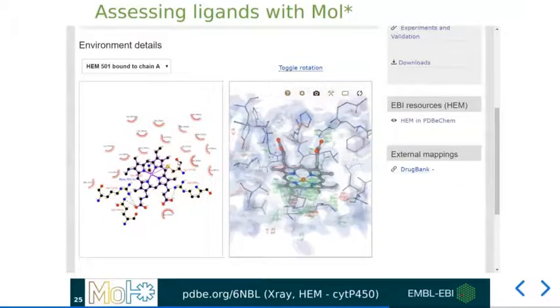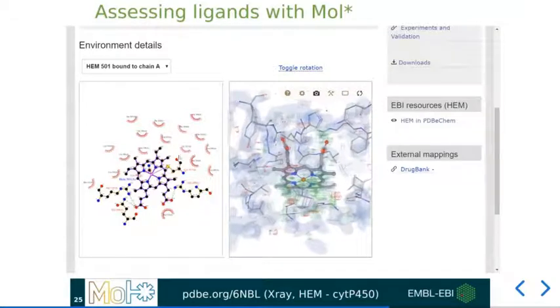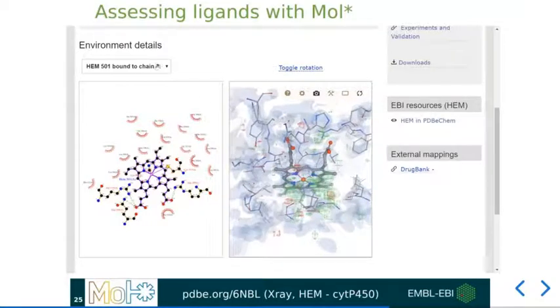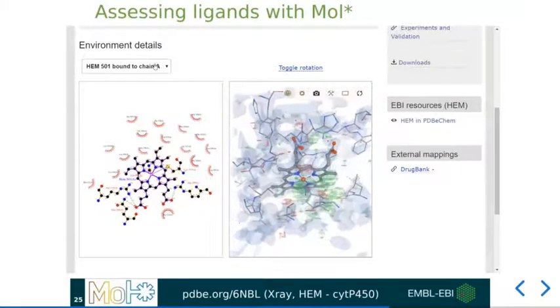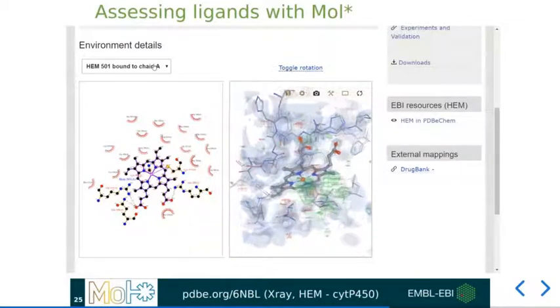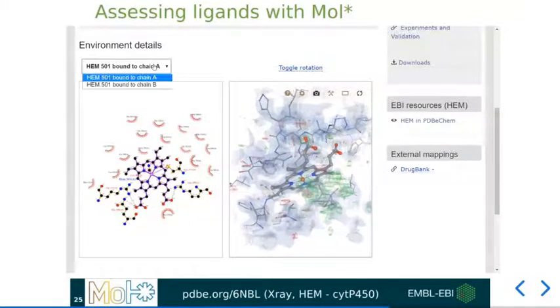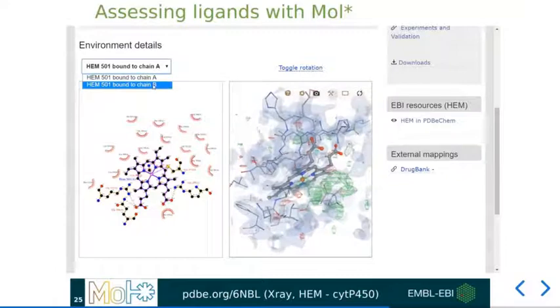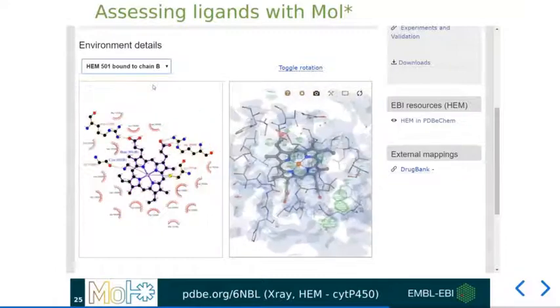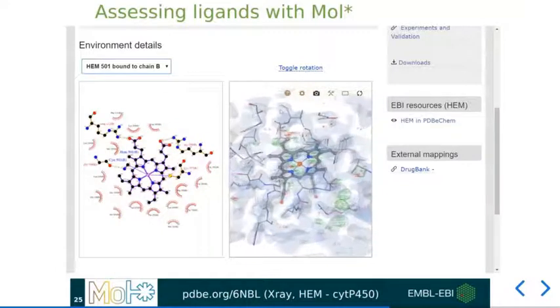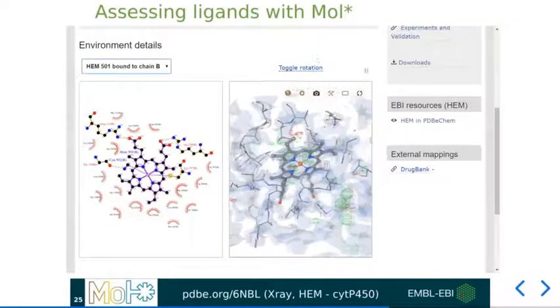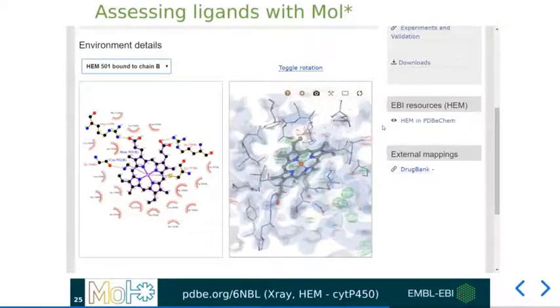If multiple versions of the ligand are in the structure, these can be zoomed to specifically by using the drop-down box at the top to get a refreshed visualization for these ligands.